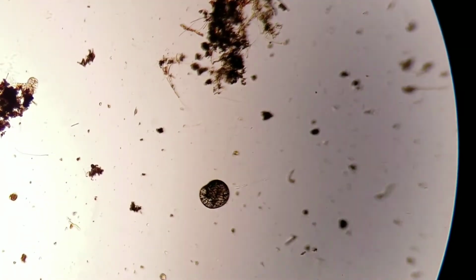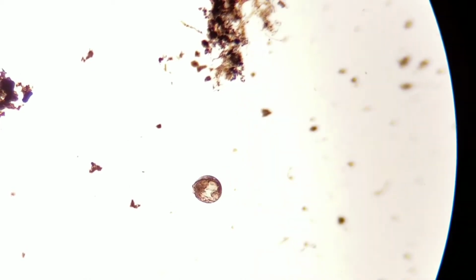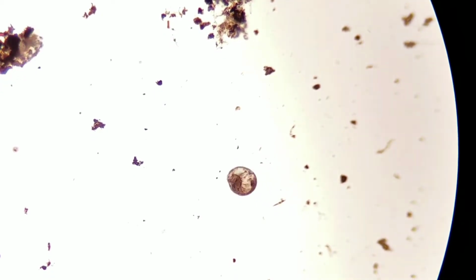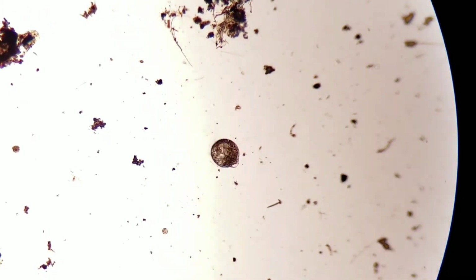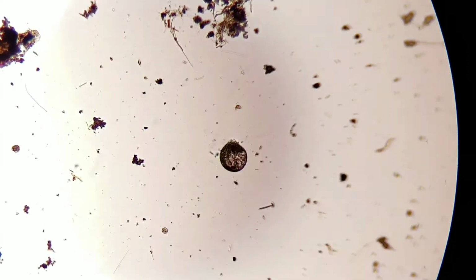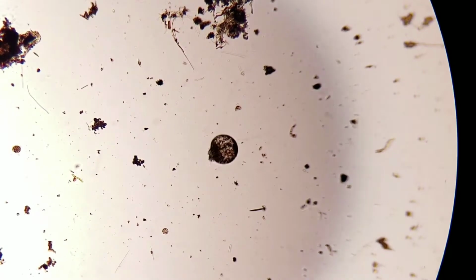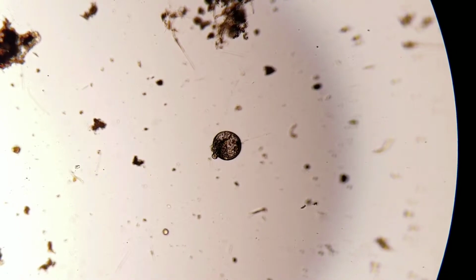Brighten it up a little. We're kind of dark here. Let's see if I can fix it. A little too bright now. Kind of got a bright spot. Let me try to fix this light. Put it there and then maybe shut the aperture. Oh, now I'm getting a spot in the middle. Oh well. It's because I don't have the right kind of setup for this, but you'll have to deal with that dark spot.